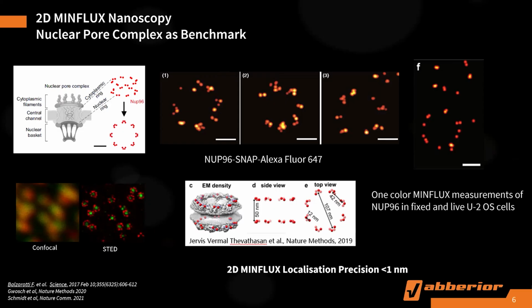And now you can compare the resolution from confocal of the nuclear pore complex, 200 nanometers. You can see no details. STED is 10 times better than the confocal, while MINFLUX is 100 times better than the confocal resolution.